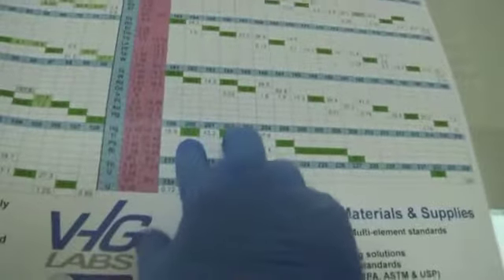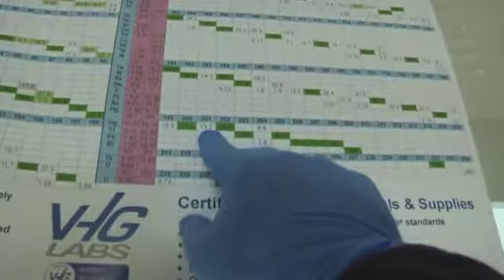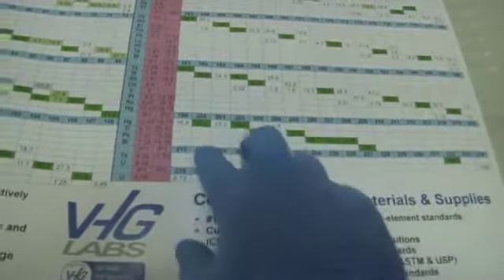So when you look at the mercury isotopes of a rice protein product that you digest here, and run through all of this equipment, through the auto sampler, the ICP-MS unit, the sample introduction system, the plasma torch, and the mass analyzer in this instrument, what you end up with is a very interesting Twin Peaks type of situation, where you see mercury at 200 and 202 artificially heightened, while the 201 isotope remains very, very low, lower than normal relative to 200 and 202. That tells you that you've got tungsten in your rice protein.